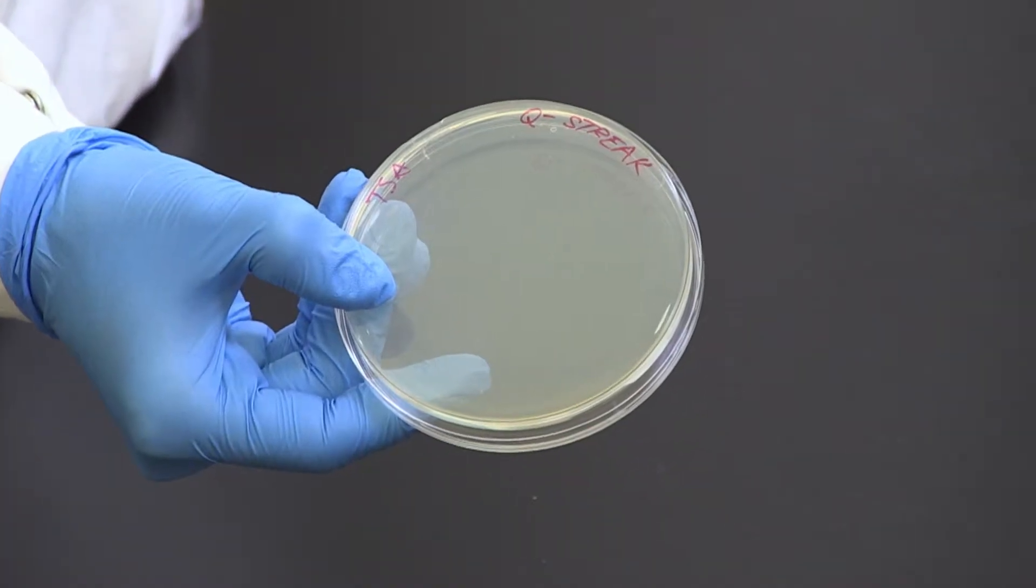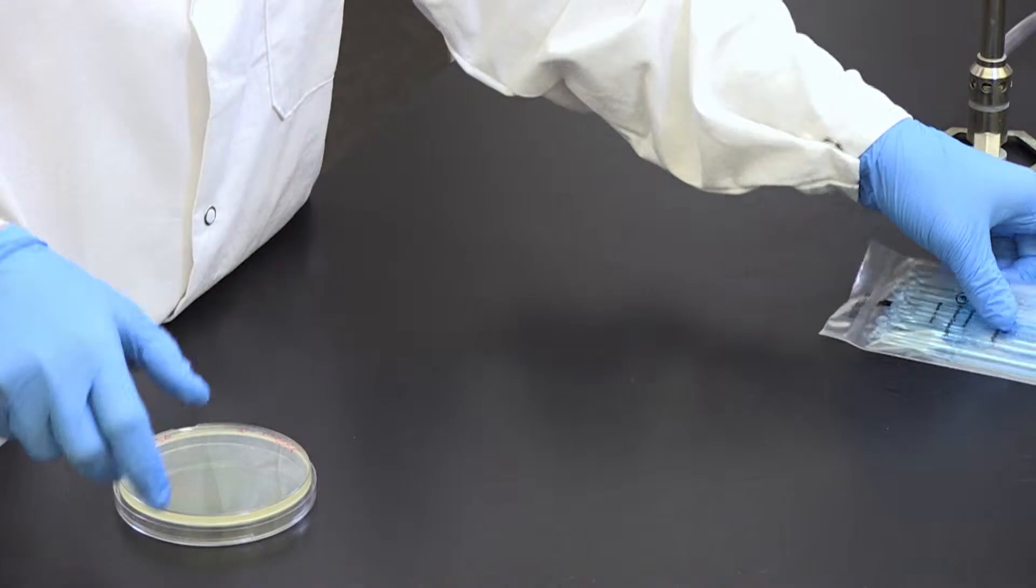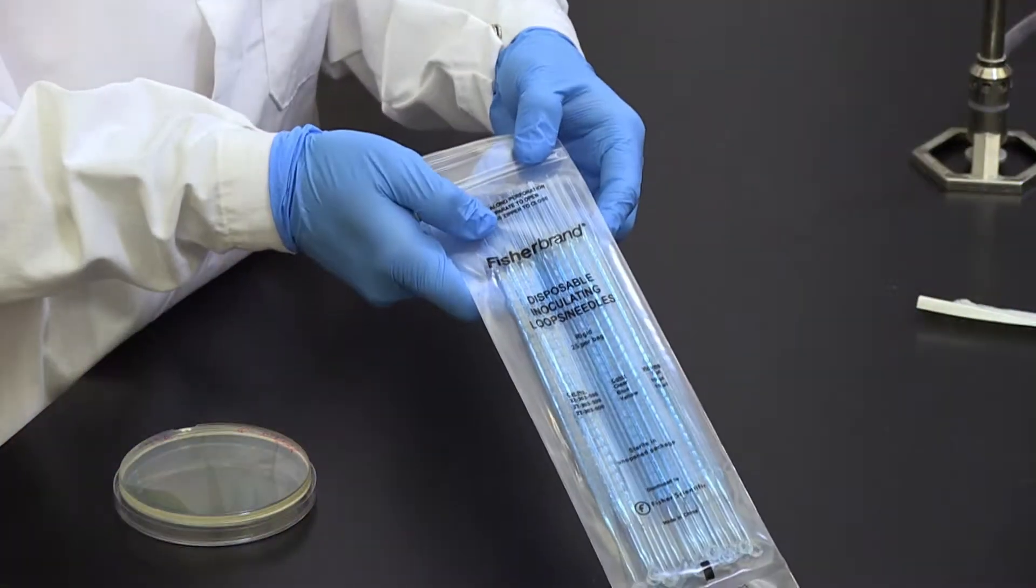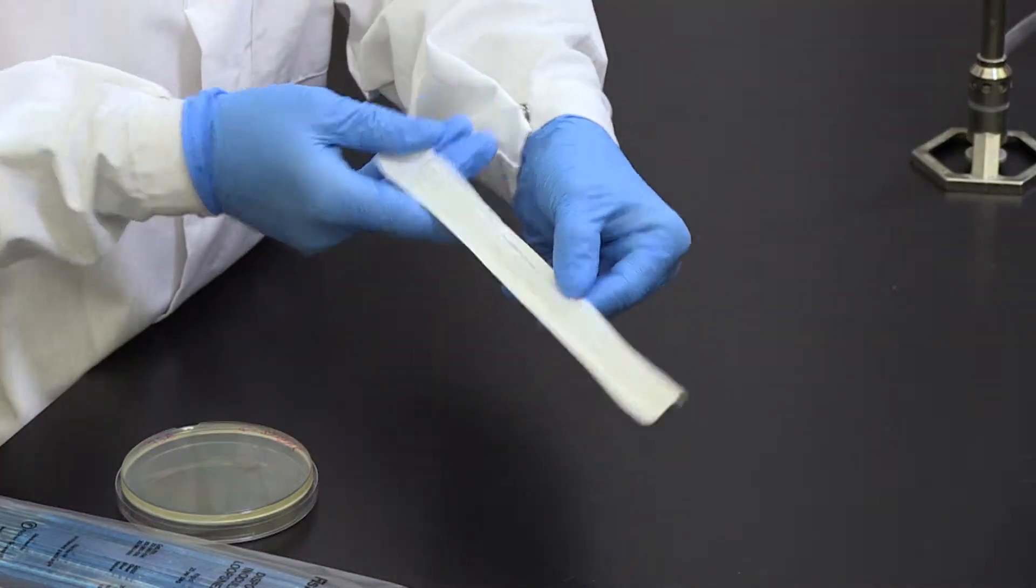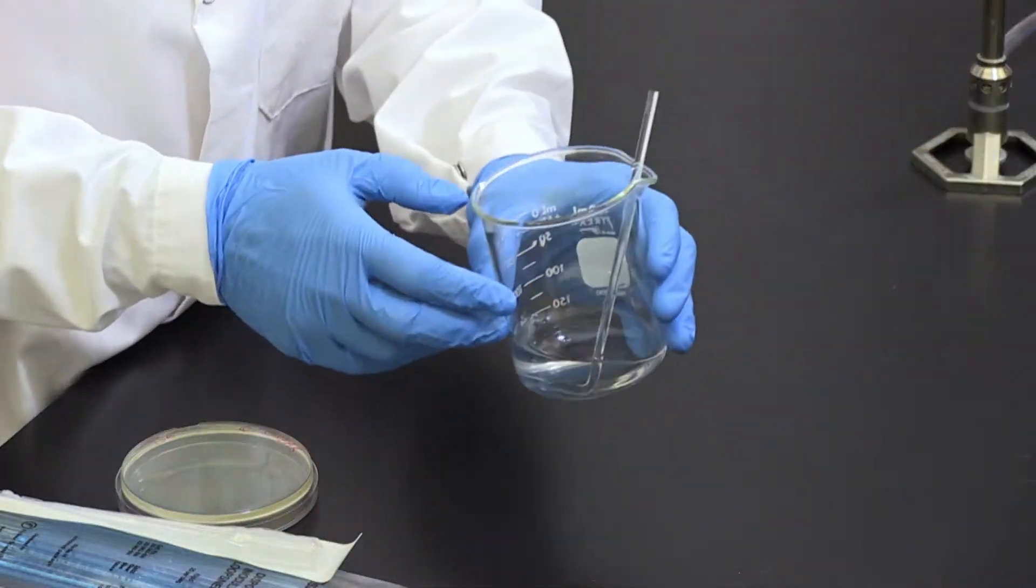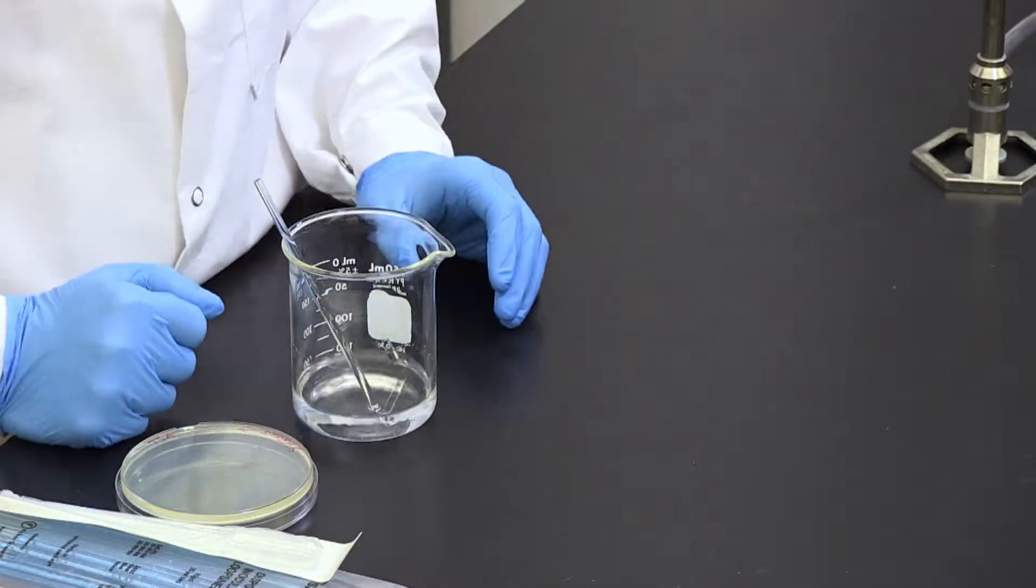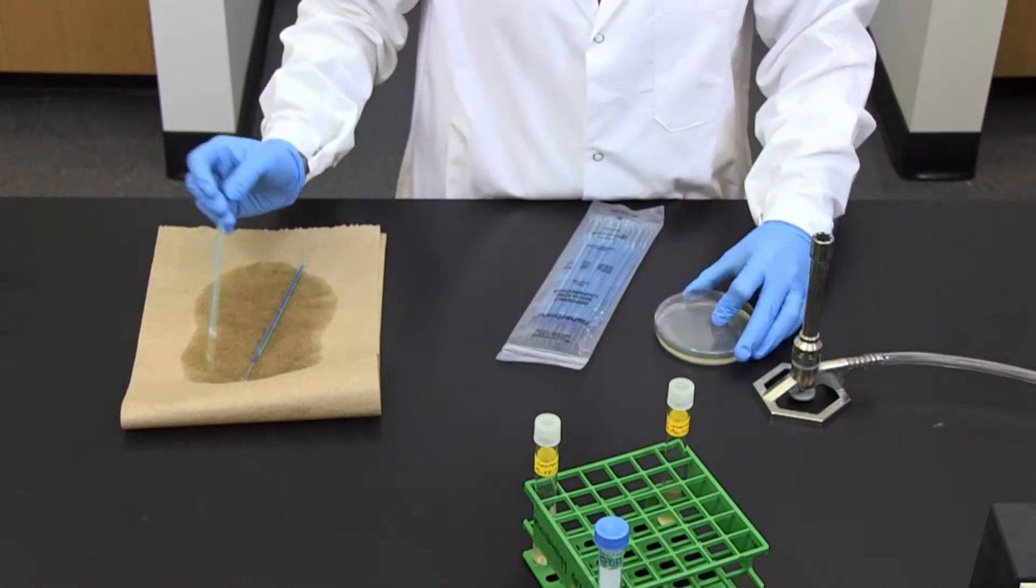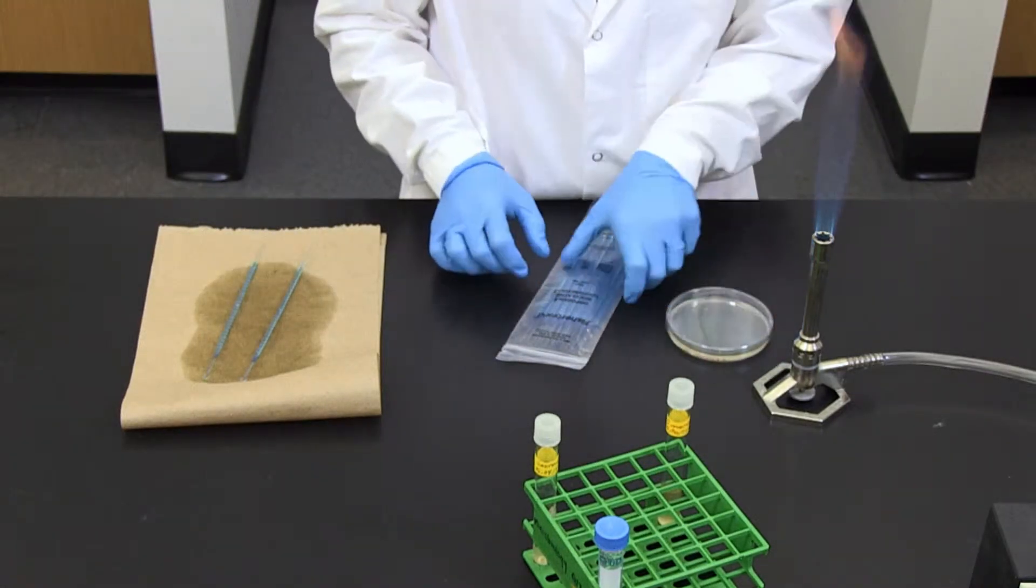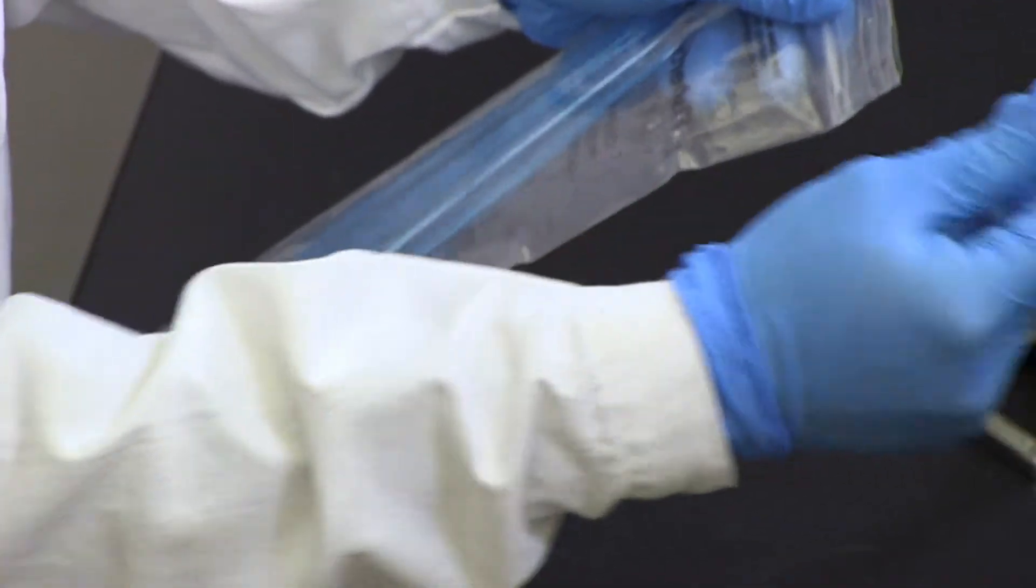All Streak Plates are essentially dilutions of bacteria using a solid medium. For this dilution to be effective, it is absolutely essential to realize that bacteria are added only once to the plate from the original culture, which can be either liquid or solid. After streaking the first sector, a sterile loop is used to reduce the number of cells, with no more bacteria being added to the plate.